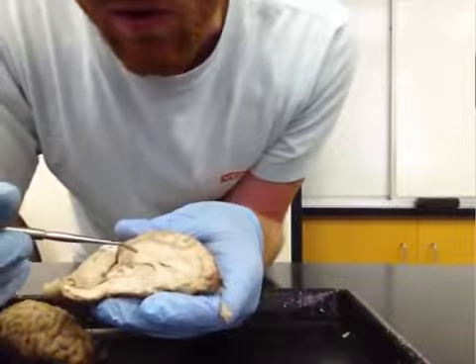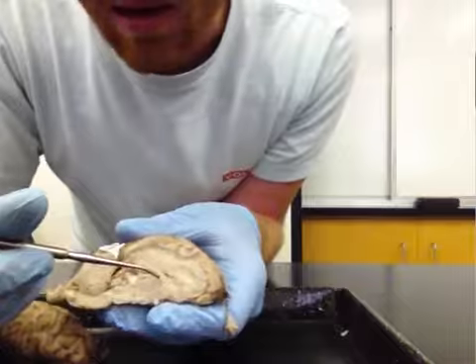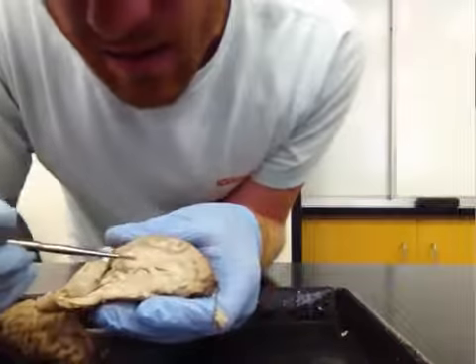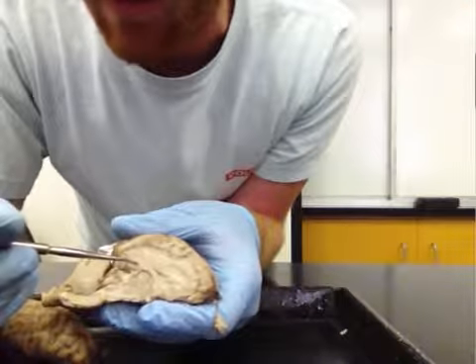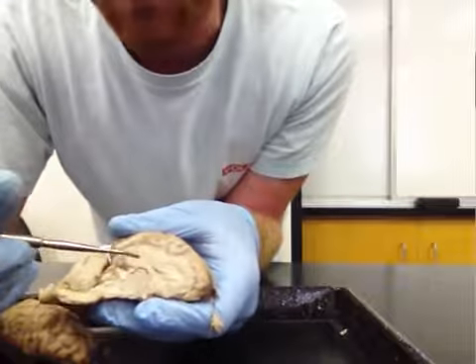Finally, a really important white matter structure. You'll be able to see this really intense white matter. And this is the corpus callosum right here. And you can see that it makes this almost inverted C shape or inverted U or C-like shape. And this white matter is connecting both hemispheres together here.